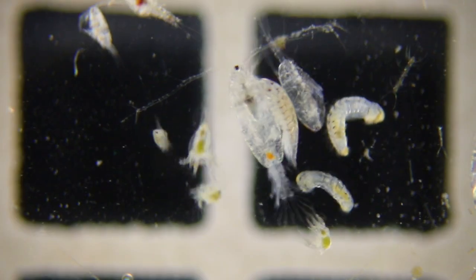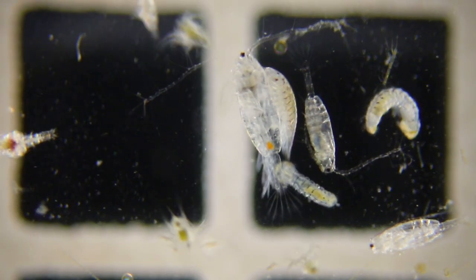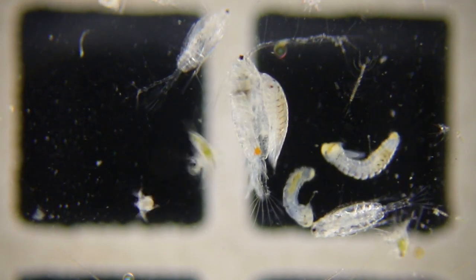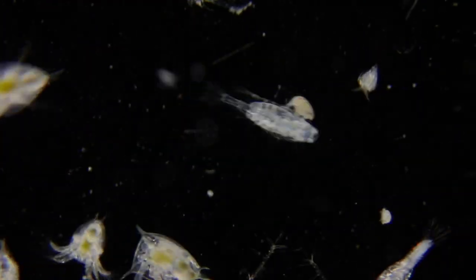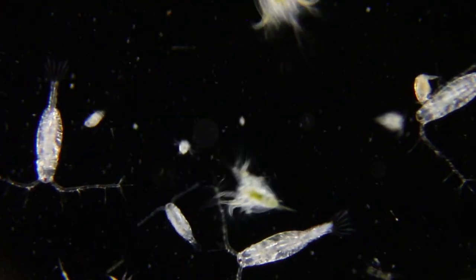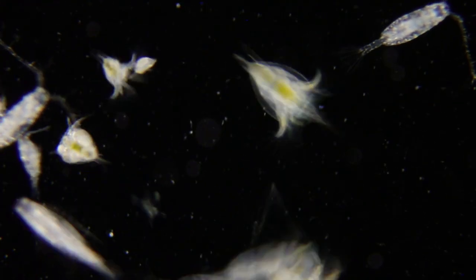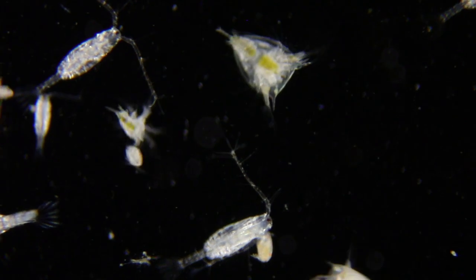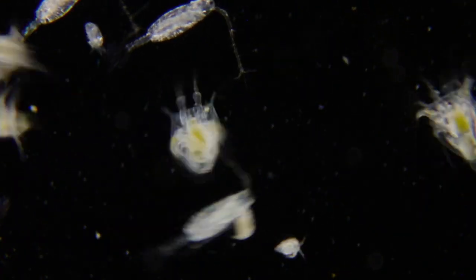The largest of these parasites that I have ever seen is attached to this copepod. It is nearly as big as the copepod itself. I also spotted a small copepod that appears to be attached to a larger copepod. Is this possibly a copepod parasite?